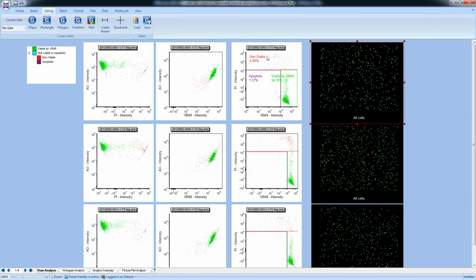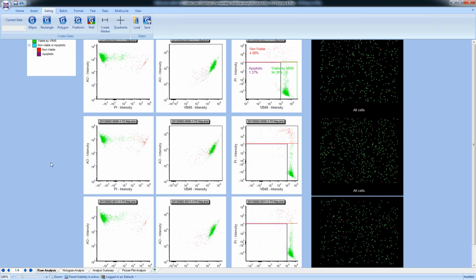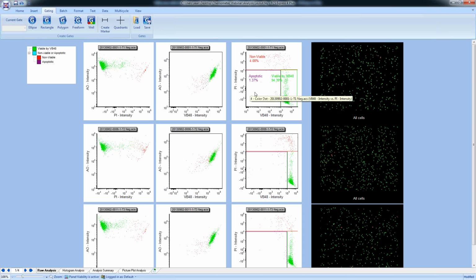Mostly these are going to be negative, but you also have high propidium iodide in here. And again, you can see that these gates apply for our three different time points. So in the assay that Henrik had put together, for each of the individual treatments, there were 3 time points: time point 1, time point 2, and time point 3. What we're looking at here is the negative control for these time points.